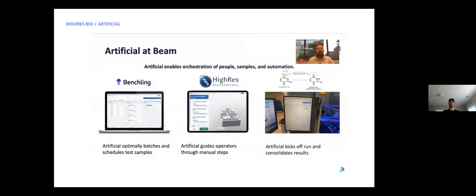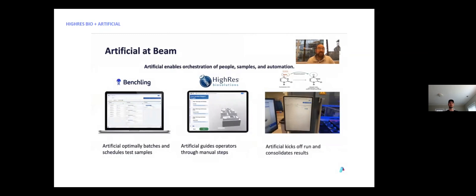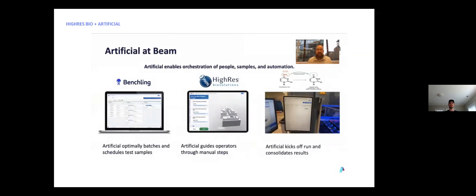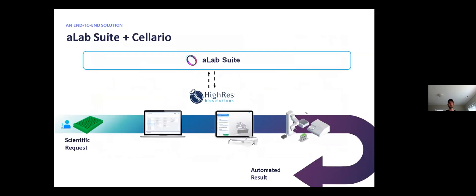It'll then take us through to the assistant where then we can load up the devices and what's really cool is then once you hit finish on the assistant in A-Lab, it's actually going to start the instrument. So you don't even have to go into Solario to then start everything to get your data. So again, we're going all the way from experimental design, connecting it all the way through execution and data generation all in one spot.